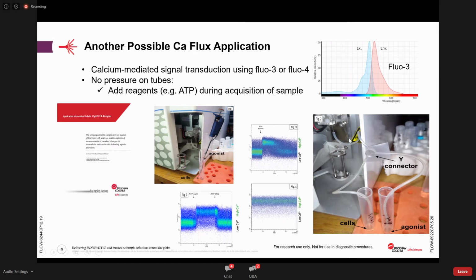In other flow cytometers, you need to record the baseline, then stop the recording, add the calcium flux agonist, and then record and restart the recording, which means that some early events might be missed by the time the sample is aspirated for analysis, and some desensitization could already occur.